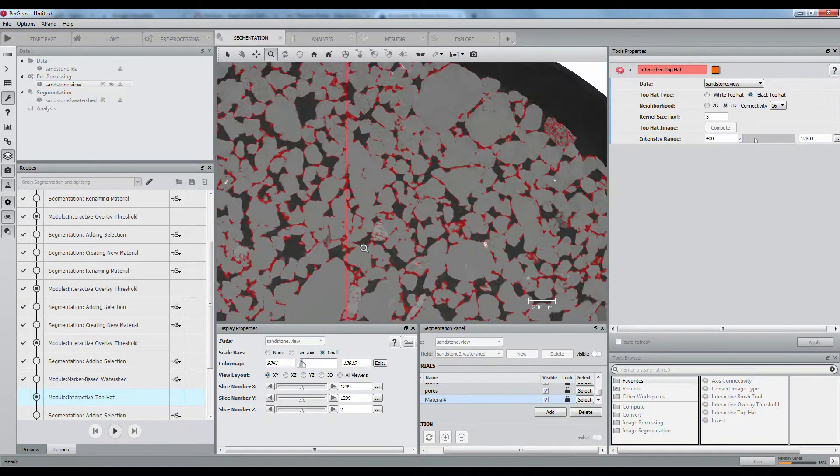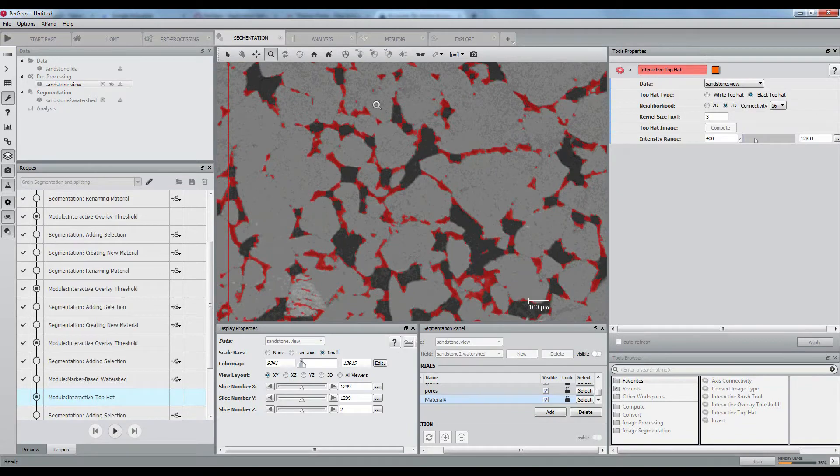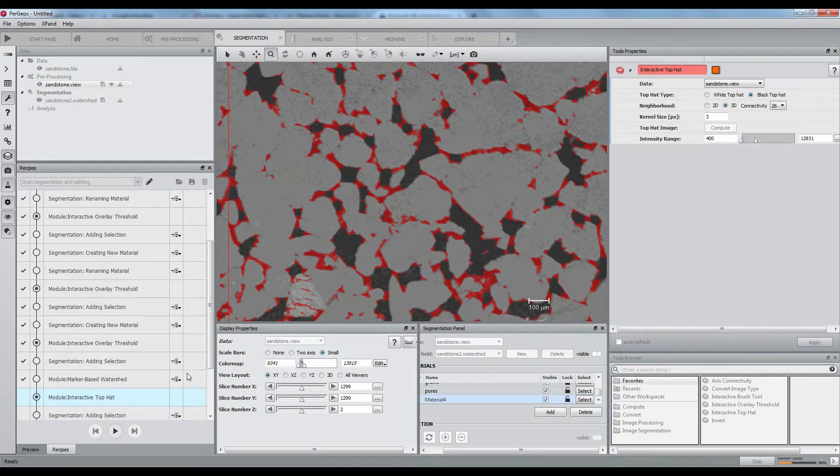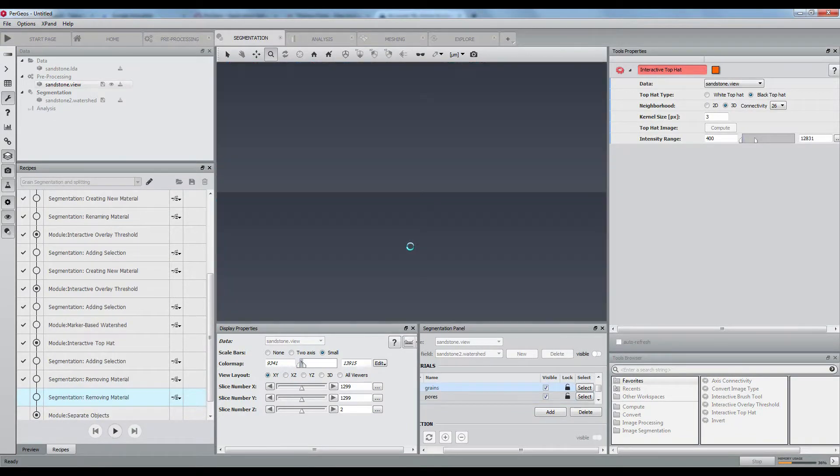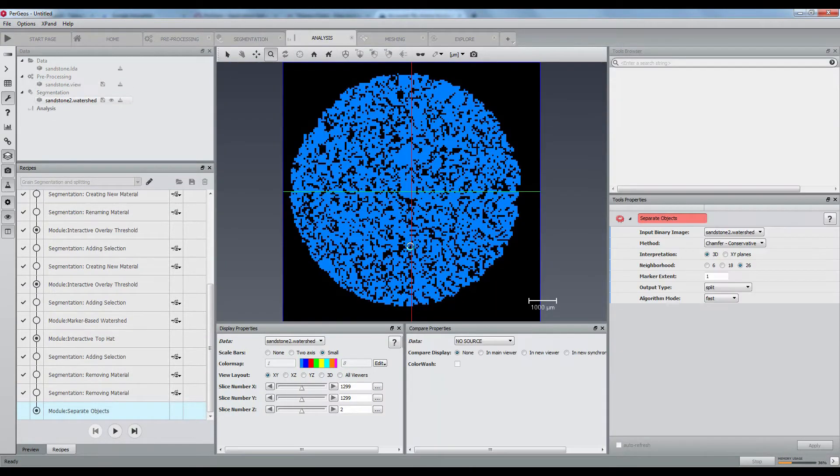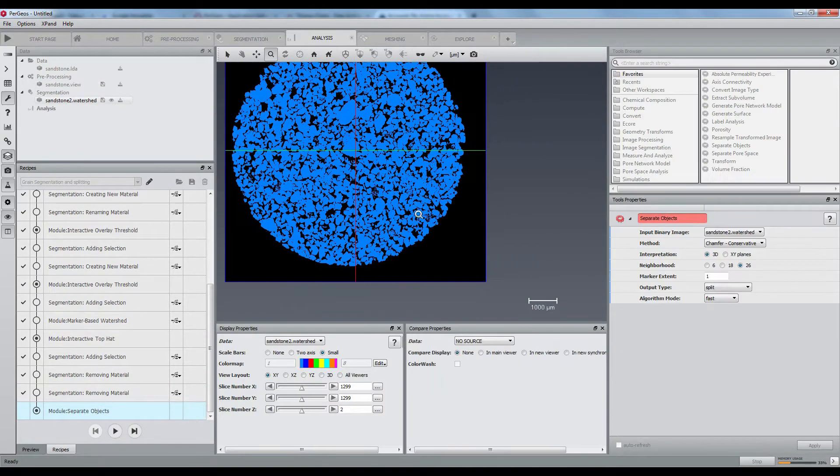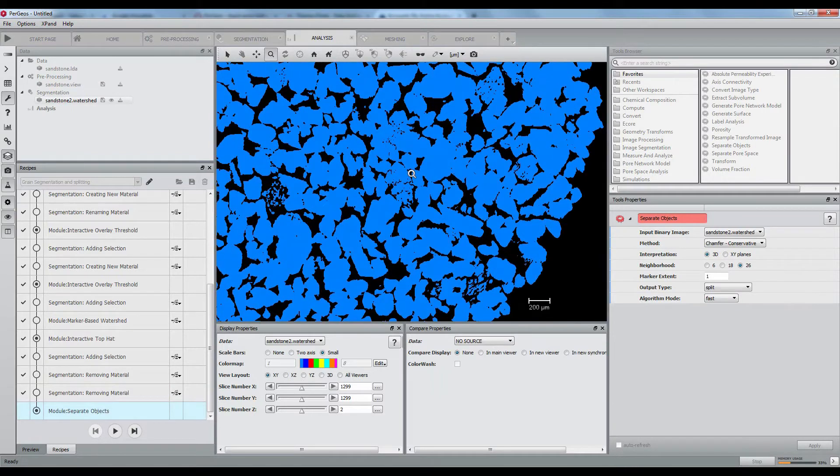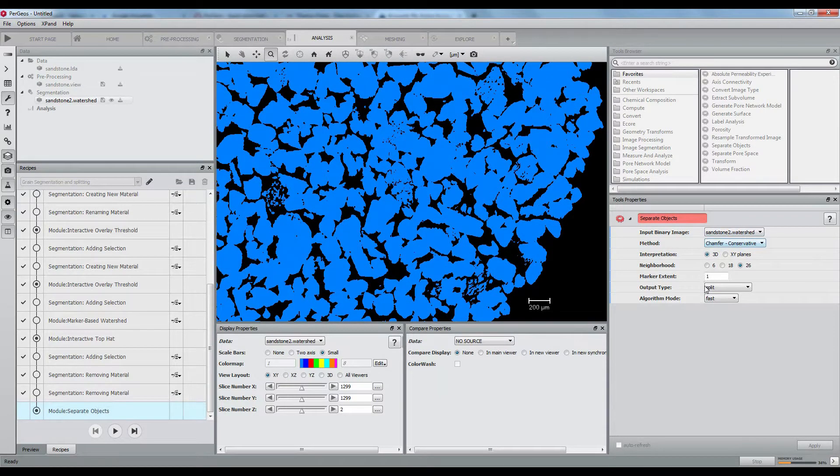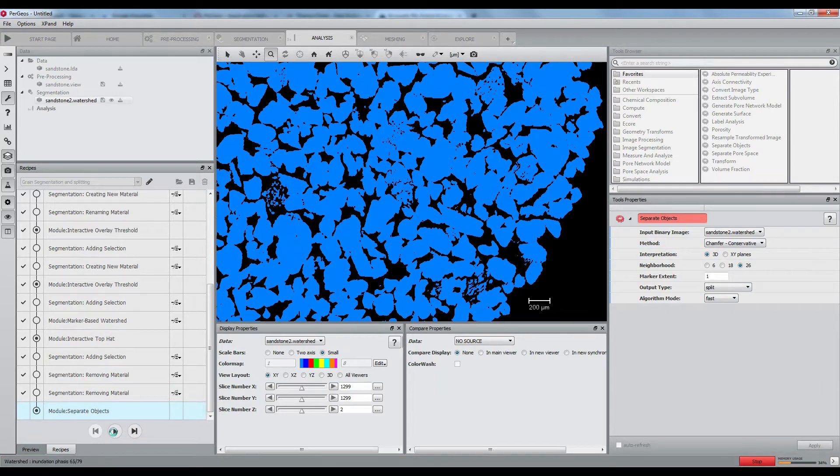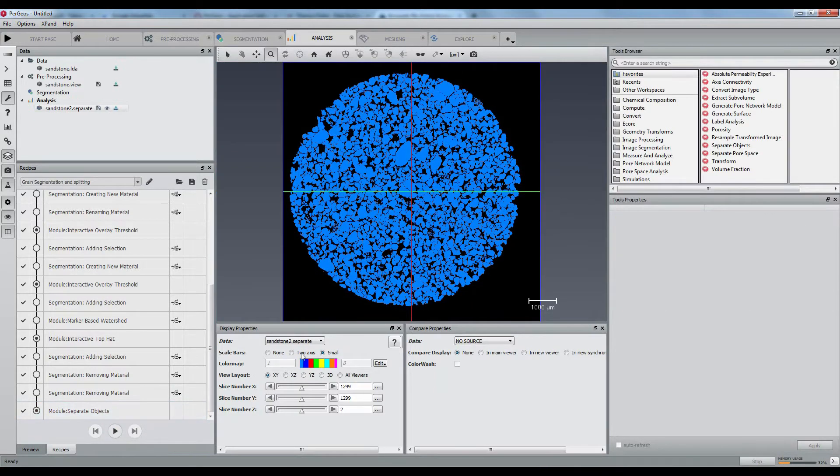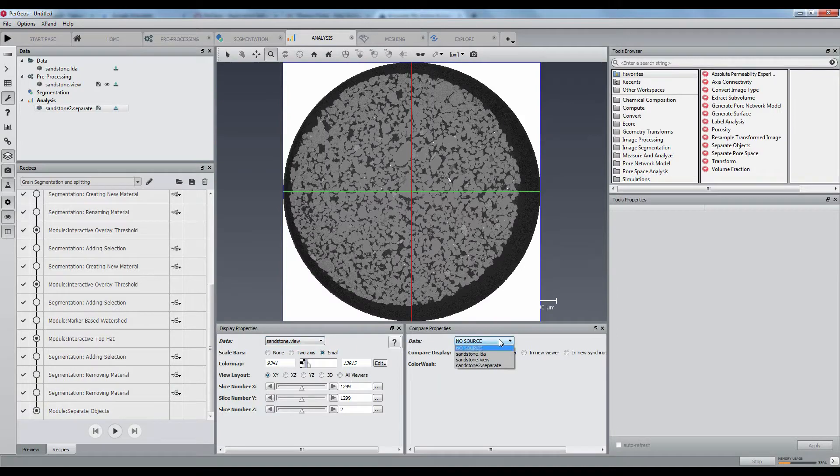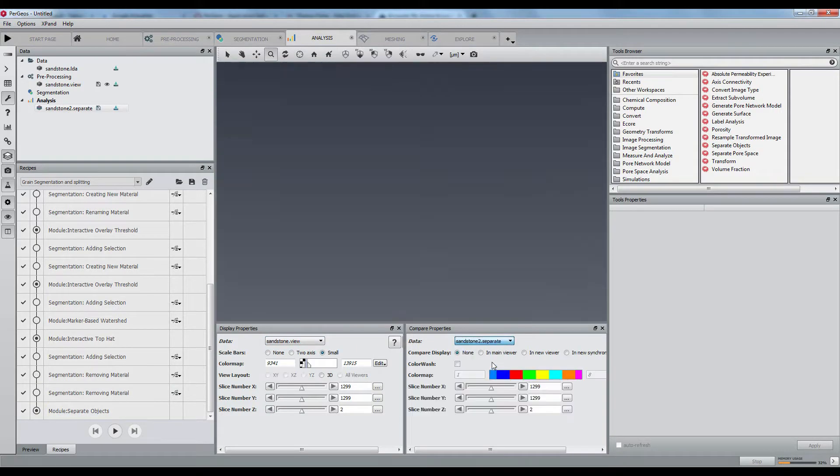Finally, a separate object step using a chamfer distance map will separate all touching grains. You can notice here how all grains have been separated into individuals.